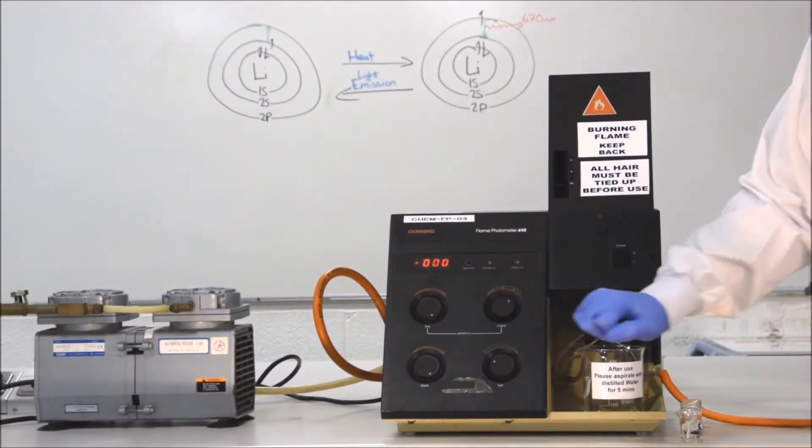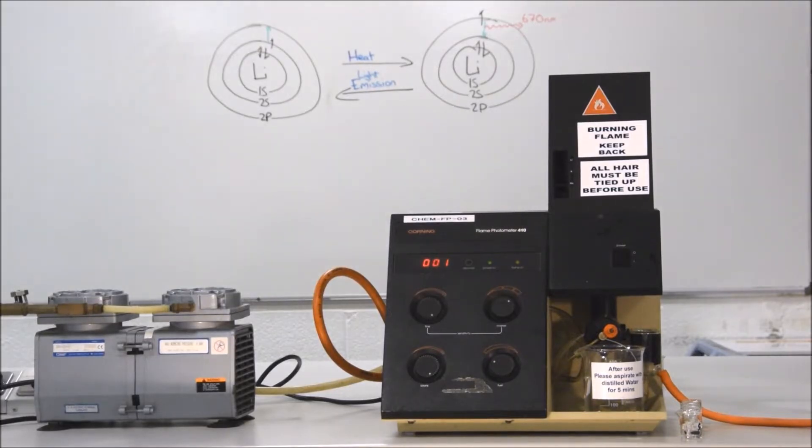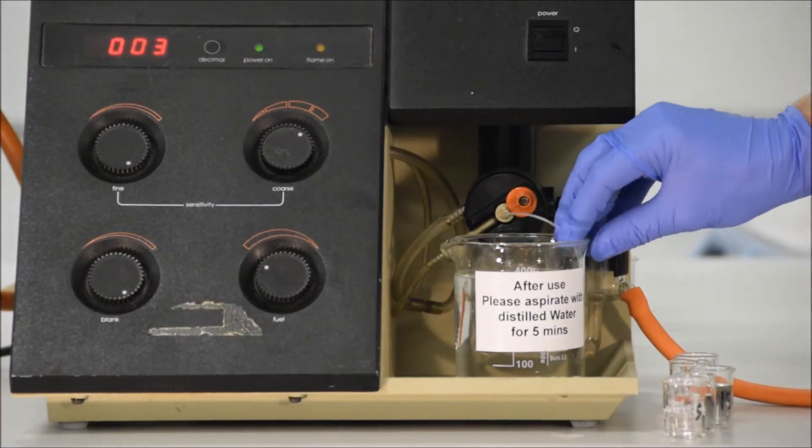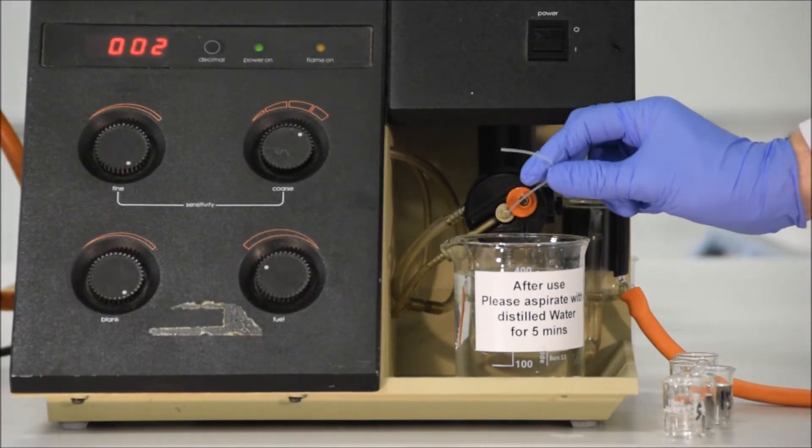At this point we want to zero the machine. The machine will drift, the zero value will change if we leave it on for a while due to changing conditions. When we're zeroing the machine, we make sure that distilled water is being taken into the aspirator.